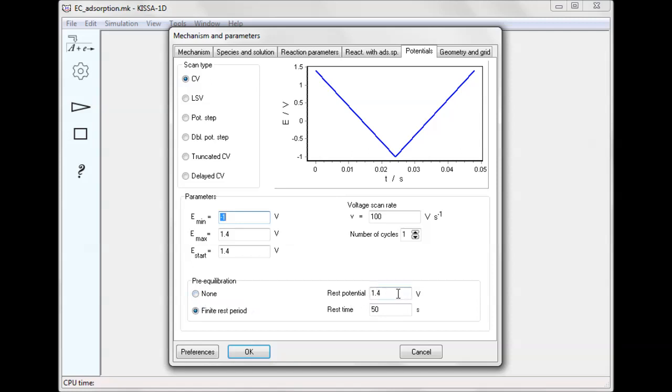In this case, rest potential coincides with the scan starting potential, and rest period duration is 50 seconds.